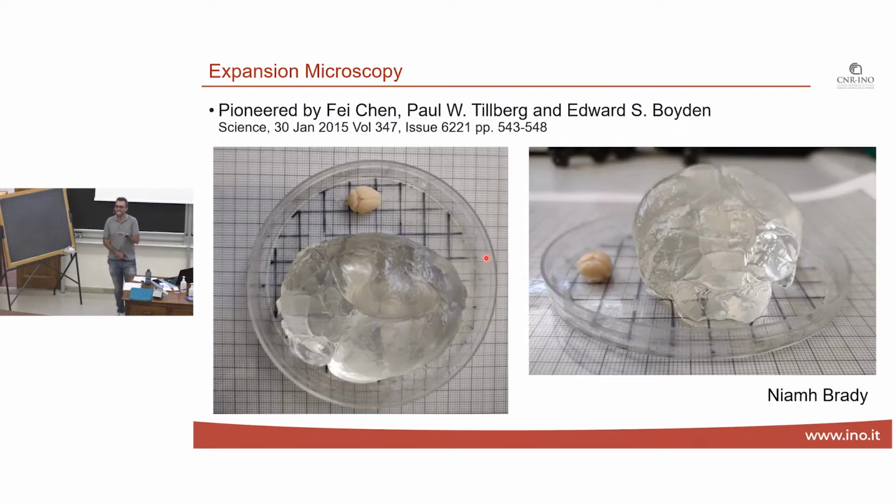I don't know the details of these protocols. It might be a polymerization thing or something like that. But once you have this hydrogel, I don't know exactly how it works. What are the steps? If it's steps in temperature or a bath, you have to put the sample into some baths or something like that. But they are able to.